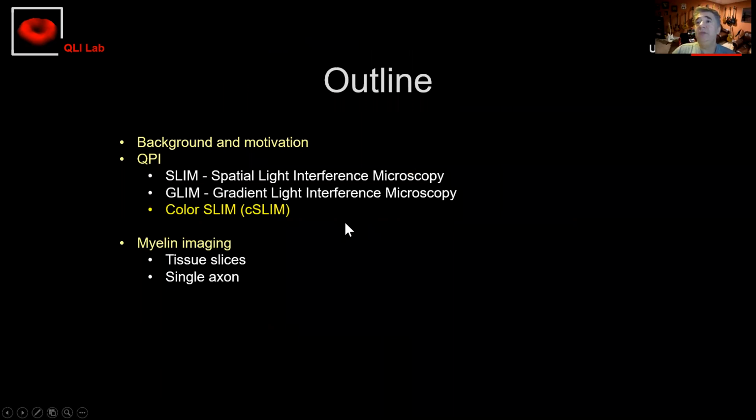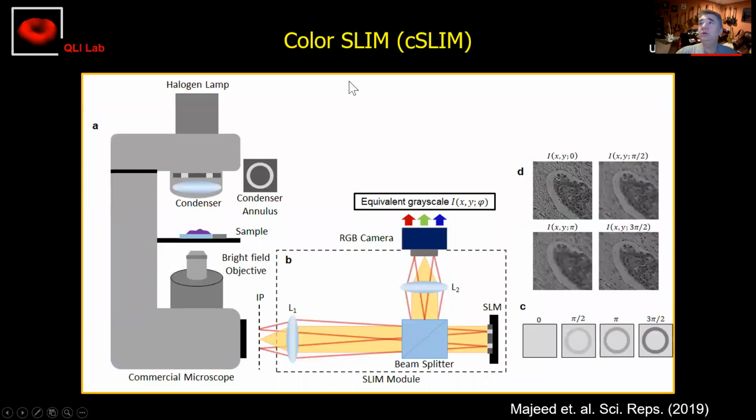One other thing that we did more recently was to be able to image pathology slides that have been already stained. So it's kind of a funny story. I submitted a grant to NIH for using SLIM to look at pathology slides with label free, and it came back rejected with some good positive criticism, but NCI was giving grants at 7% or something at the time, and now it's up to 9 or 10.